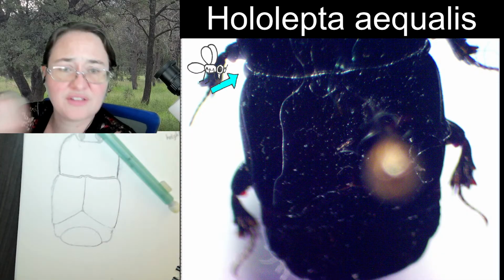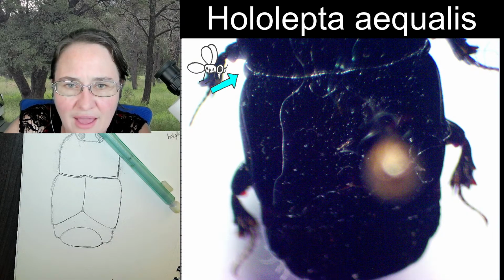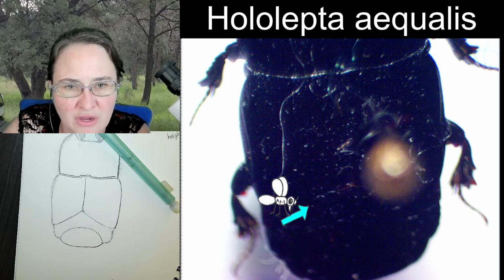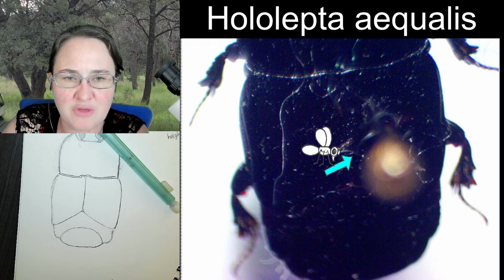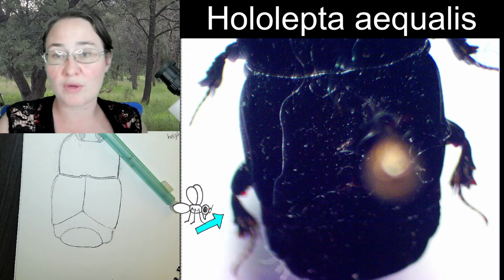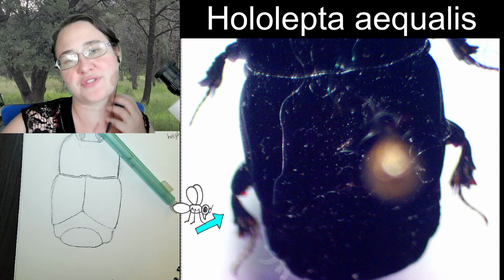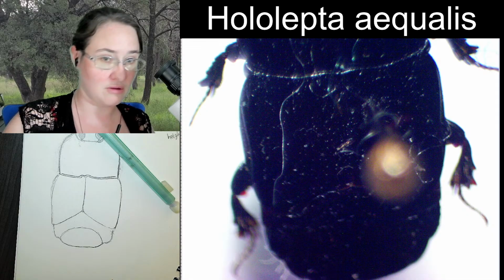Now, on the elytra here, you can see the outside of the elytra right about here, and I can see this line that starts from here and goes up diagonal in this direction. We also have the pin here that is an issue. So I'm going to rotate the beetle one more time to get the pin out of the way, and I'm going to increase the light. I'm going to overexpose this image so that we can see the lines better on the beetle.